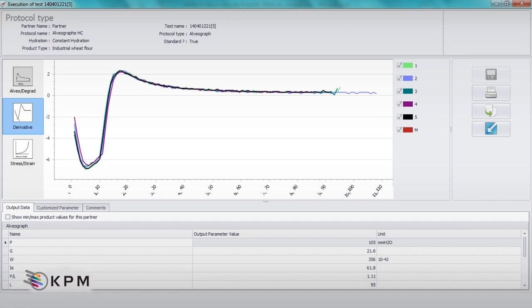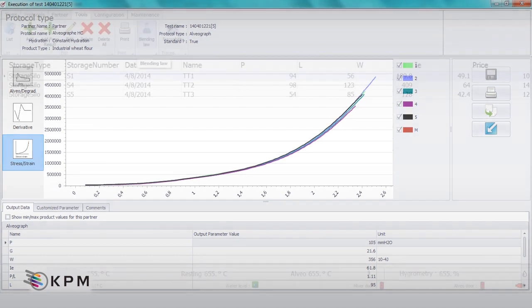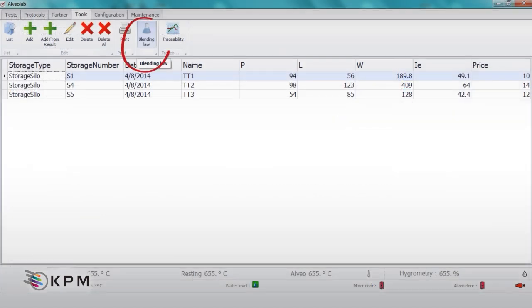Additional parameters such as first derivative, stress strain parameter and mixing consistency are now available. A new feature for optimizing wheat and flour blends has also been introduced.